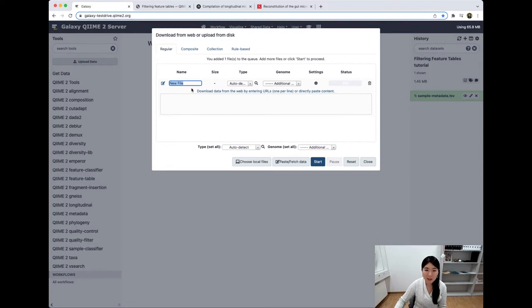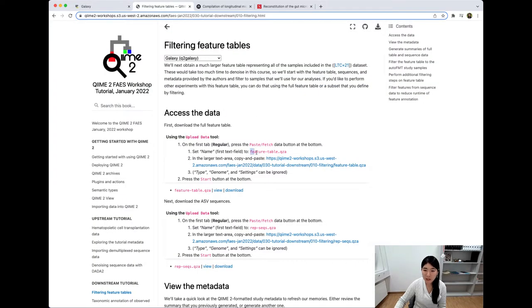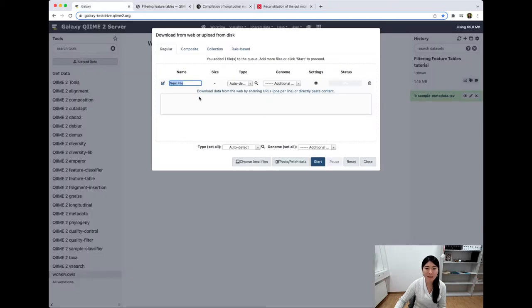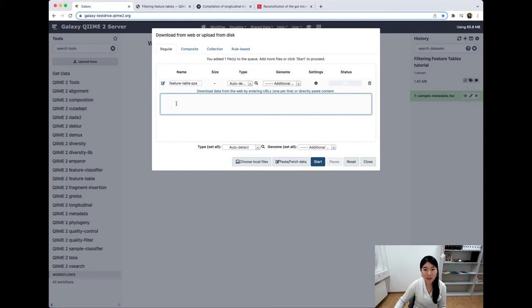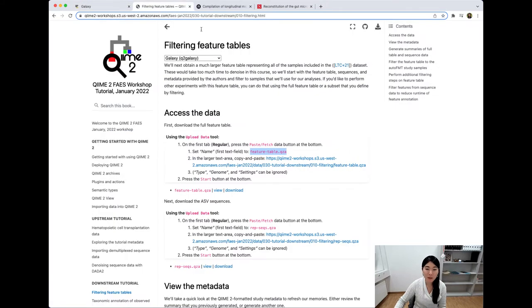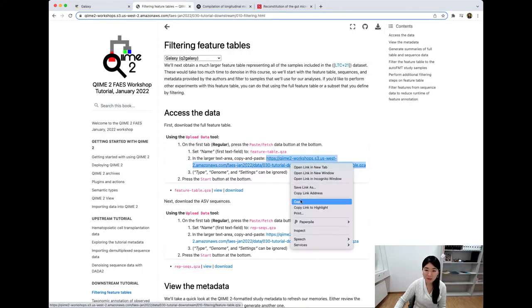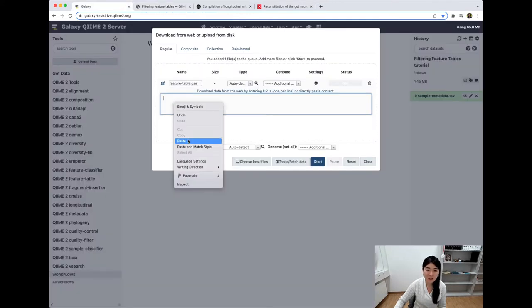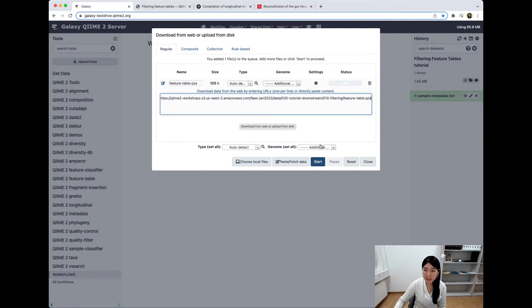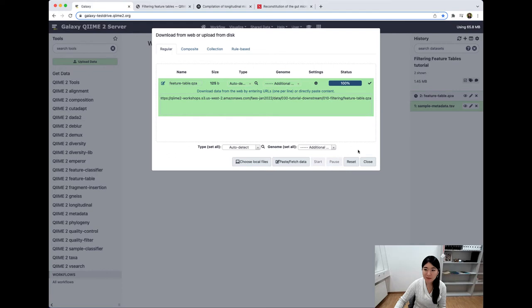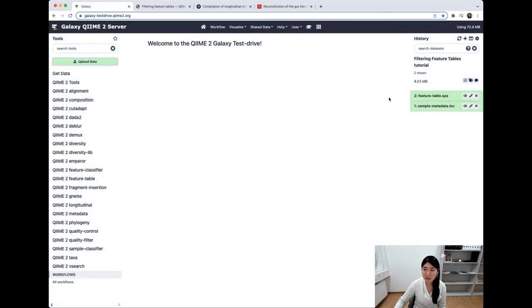Here in this first text box, we can place the name of our new data file. Our tutorial page tells us that we want to call this feature-table.qza. The .qza tells us that this is a QIIME artifact, and this is the full feature table that we're interested in. Copy that, paste that here. Next, we add the link to the file we want to download, also from our tutorial page. Copy and paste here. We don't need to set any other options — just press start. When we close that, we can see it's uploading, and it's uploaded.